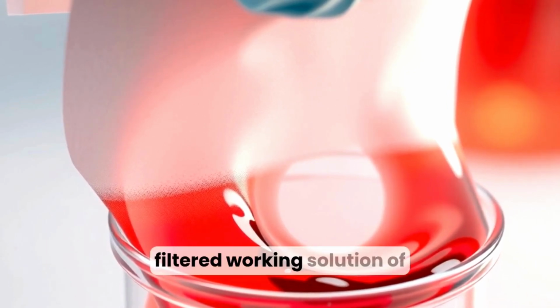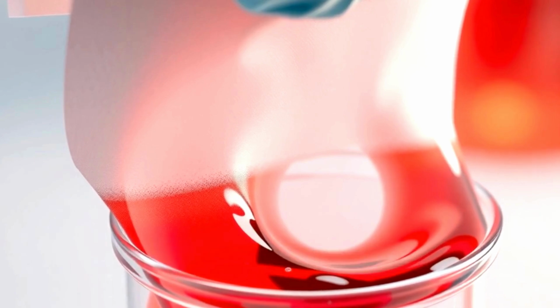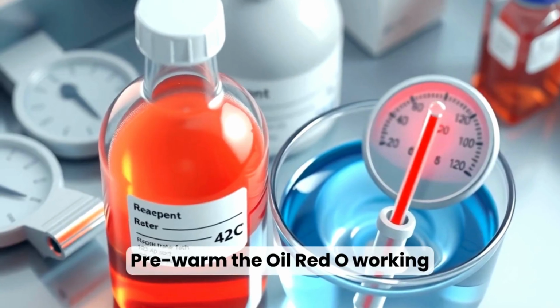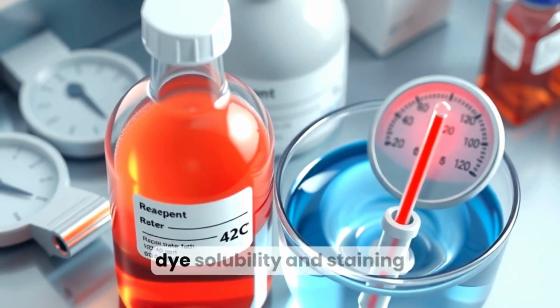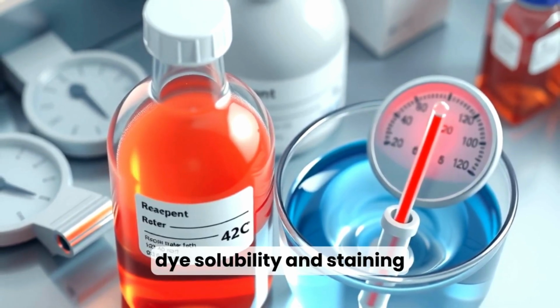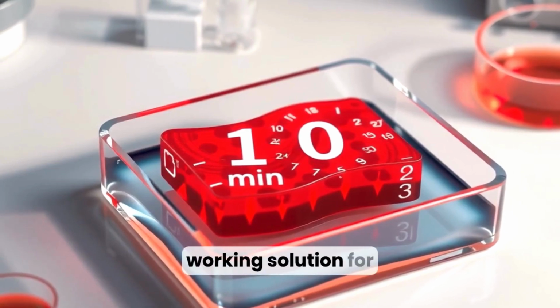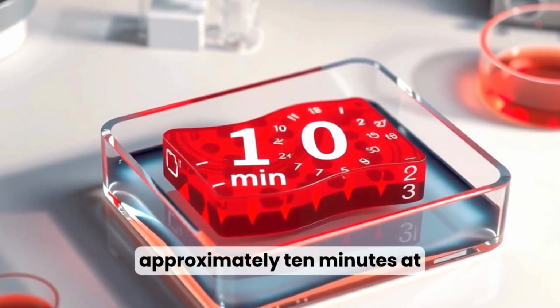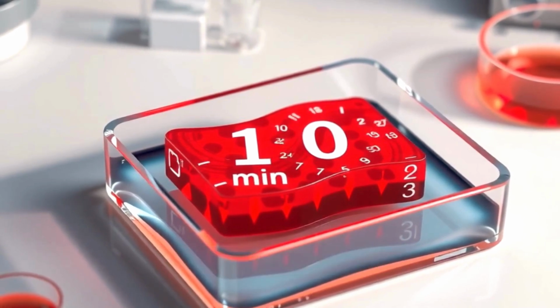Prepare a filtered working solution of oil red O from the stock following recommended ratios. Pre-warm the oil red O working solution to room temperature or slightly warm. This improves dye solubility and staining consistency. Immerse slides in oil red O working solution for approximately 10 minutes at room temperature, monitoring staining intensity visually.